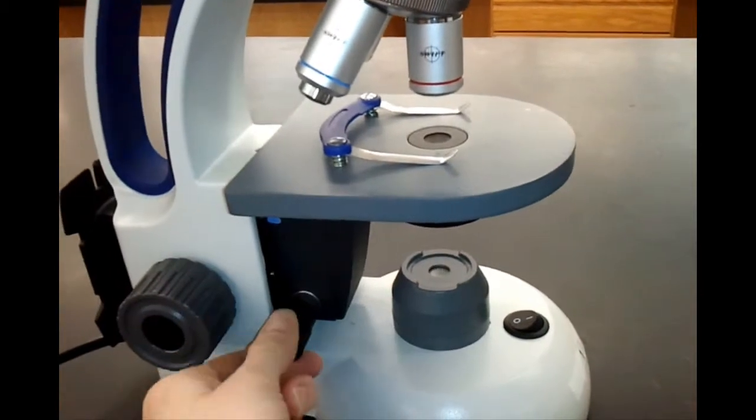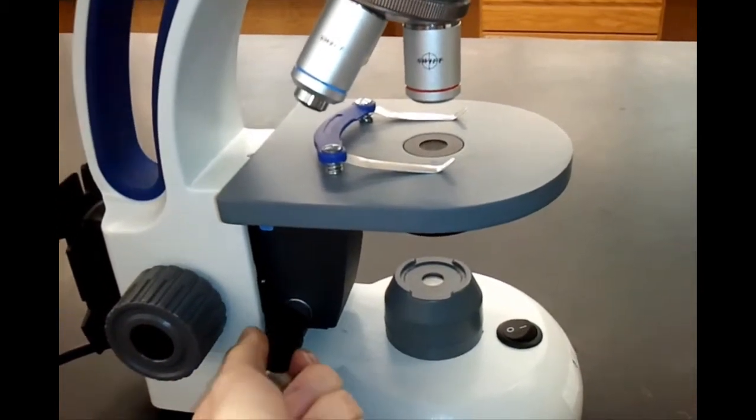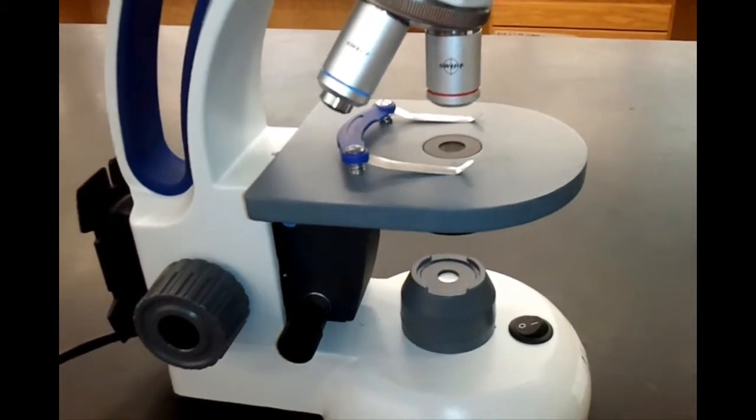The smaller knob is the fine adjustment knob. This knob is used to completely focus the image.